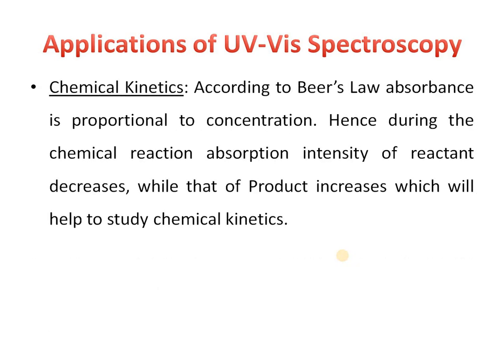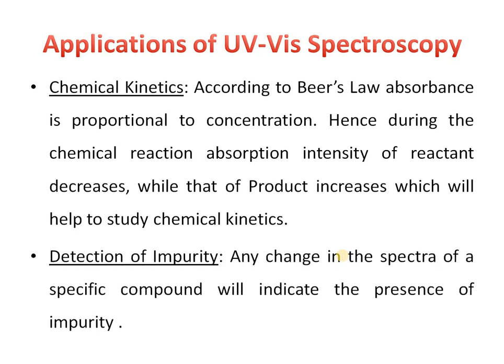Then chemical kinetics. According to Beer's law, absorbance is proportional to the concentration. Hence, during the chemical reaction, absorption intensity of a reactant decreases while that of the product increases, which will help to study the chemical kinetics.